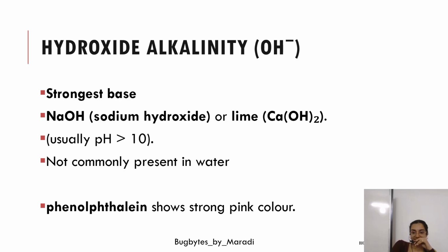We'll be discussing hydroxide as well as carbonate as well as bicarbonate alkalinity. Till now, we will be discussing about these a lot. So what are they? What is their role or what is their importance? So we'll start with the hydroxide alkalinity, OH minus.